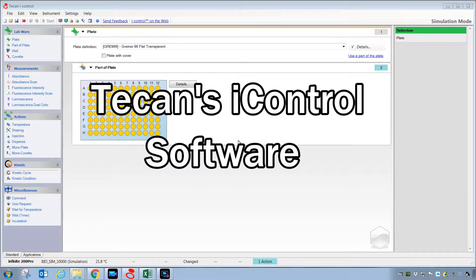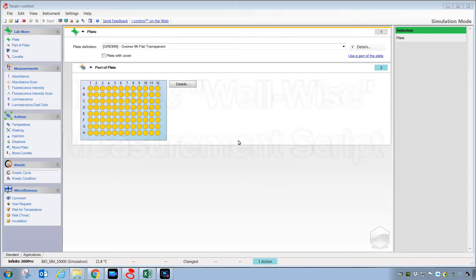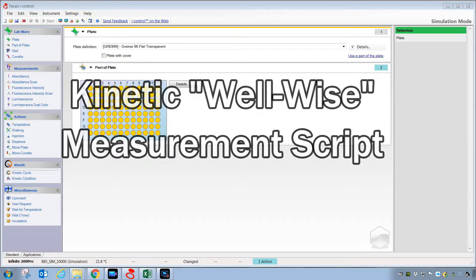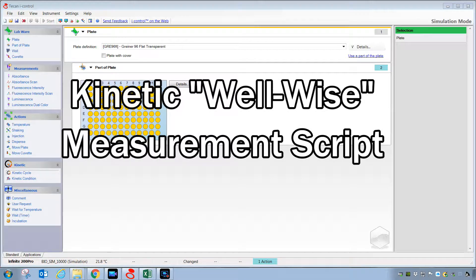Hi, this video is part two of a series covering the use of TCAN's eye control software for collecting kinetic measurements from microplates.